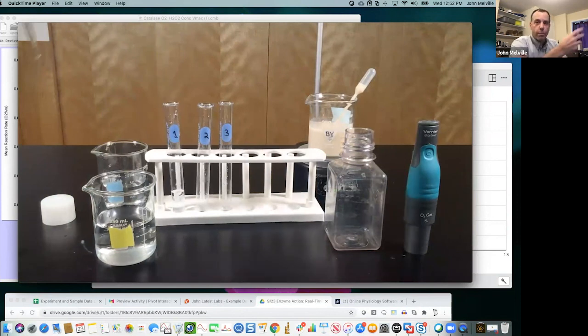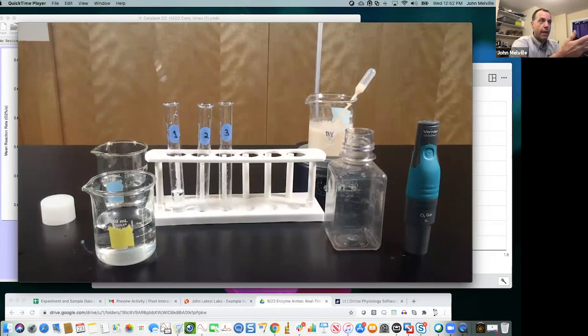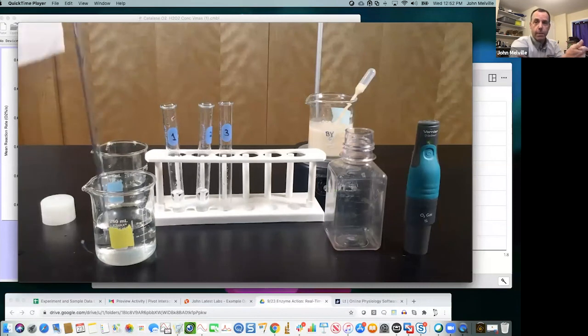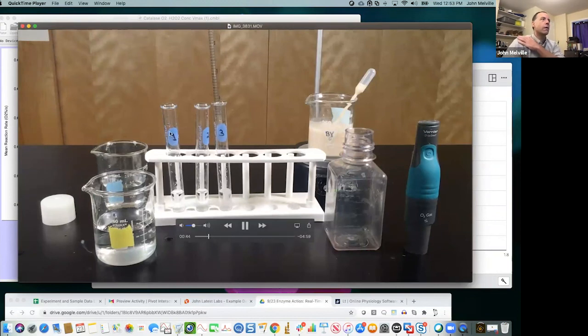So like I filmed each one. I just did the first run. I didn't do all 3, but it's super easy to film, and then you could pass this out to students and say, here's a video of how the experiment's done. I have this for how the basic experiment is done. I also have it for how I did it for temperature, and then I also have it for pH, where I did it in 3 different pHs, where I showed how it would be done. Does that answer your question for how we would use these resources with video?